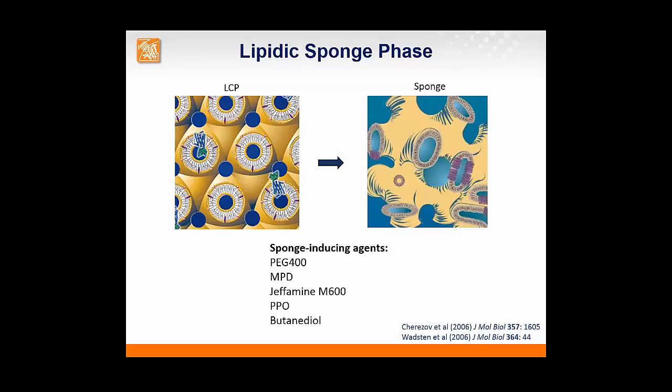However, the long-range order is lost in this case, and there are large fluctuations, and it has liquid-like properties. Therefore, there are no more restrictions on diffusion of a large membrane protein or aggregates of the protein in sponge phase. And the results of the LCP FRAP assay would be inconclusive.